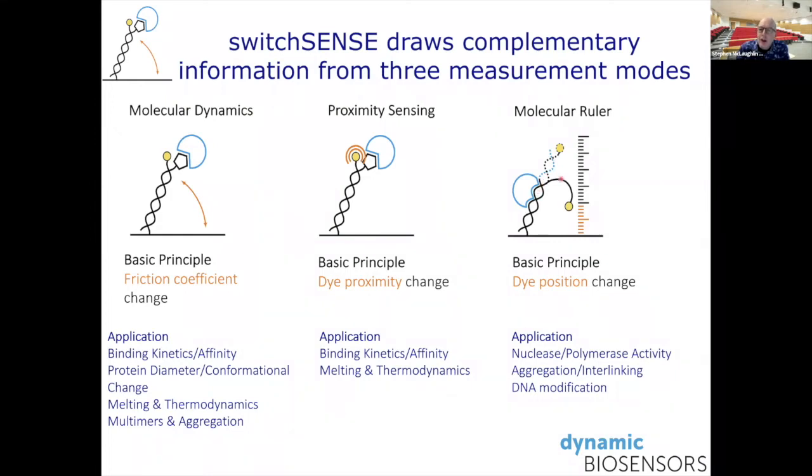And that will then change the flexibility of the end here, and then what the total fluorescence is going to look like, because you'll have the fluorescence group coming closer to the surface or further away from the surface, depending upon what the state of the nanolever is.